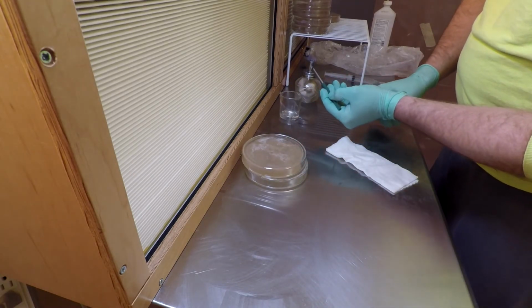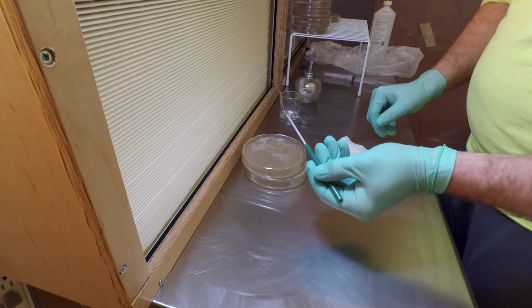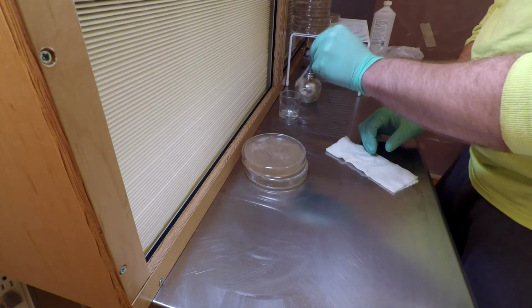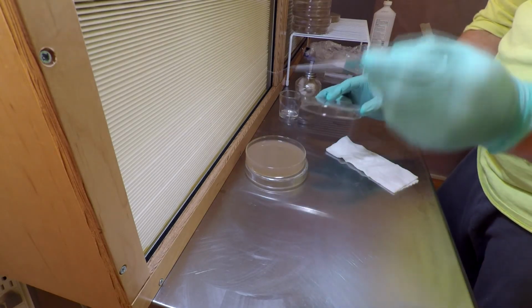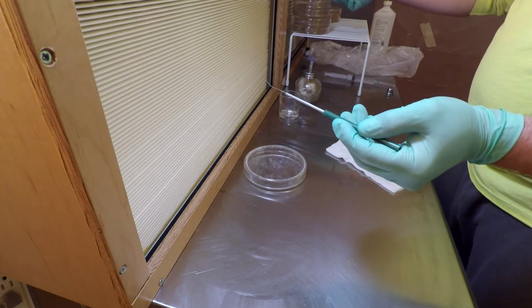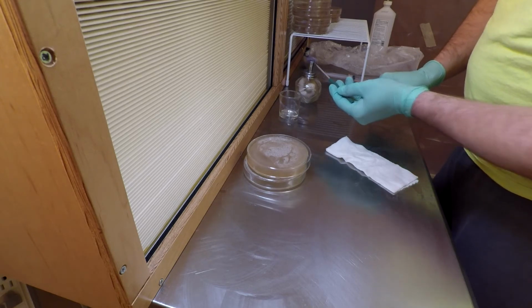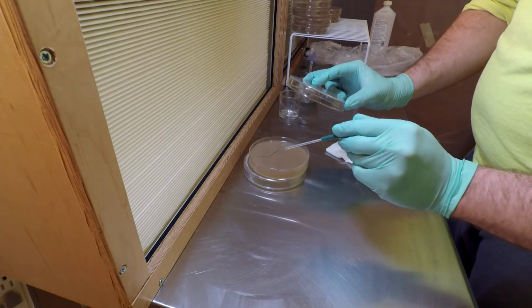I'm going to repeat the procedure. Heating up the loop till it's red hot. Touch it, make sure there's no excess water hanging on there, and then streak it. I'm doing a zigzag pattern with these first few dishes, making sure that I'm not overlapping any line, because we want everything to be thinned out as much as possible. Remember, no circular patterns, no patterns in one area. You want lines of mycelium to pop up.